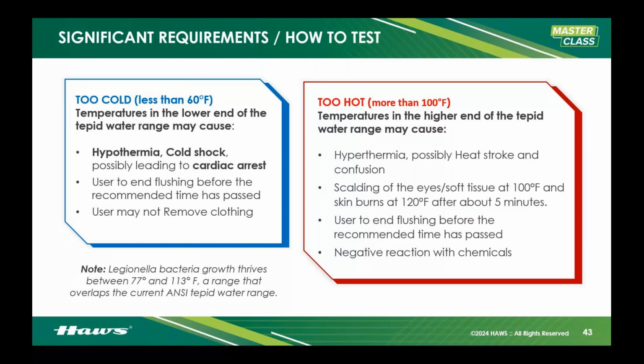Now, the other reason we want to keep that water temperature down is the negative reaction with chemicals. Depending on the chemical, you may have a negative reaction with warmer water. 80 to 85 degrees water is what we preset all of our stuff to. Mixing valves, instantaneous heaters, etc. are set to 85 degrees. I mean, again, it's not going to be nice and toasty like your warm house shower, but it is going to prevent negative reaction with chemicals and keep you warm enough that you are not going to have the negative effects of too hot or too cold.